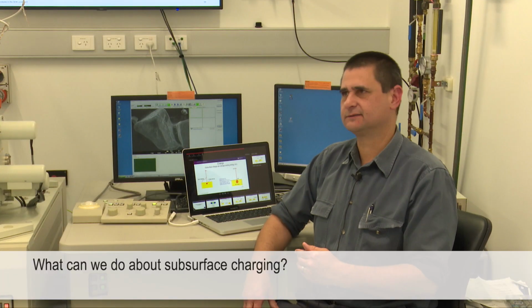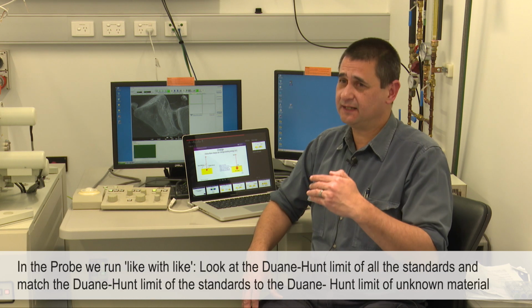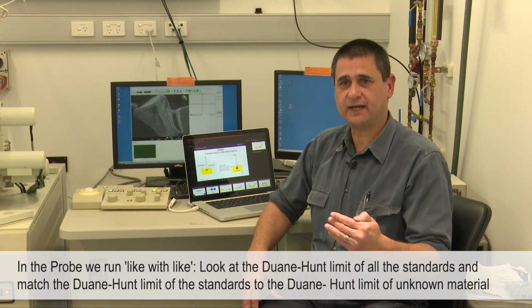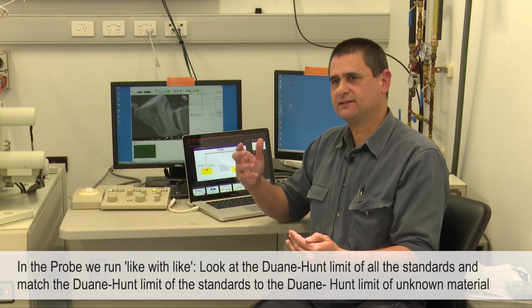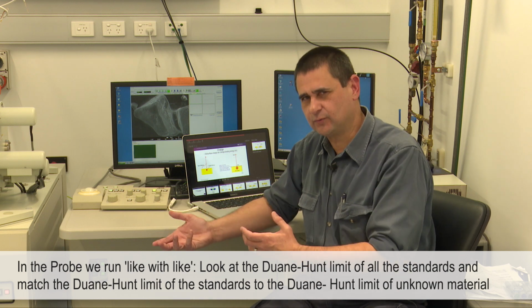What can you do about it? Well, coat it, doesn't always help. Be aware of it, check the Duane-Hunt limit. In the probe, one of the techniques is we run like with like. I look at the Duane-Hunt limit of all my standards, and then I match the Duane-Hunt limit of my standards to the Duane-Hunt limit of my unknown materials. That's the advanced way of doing it.